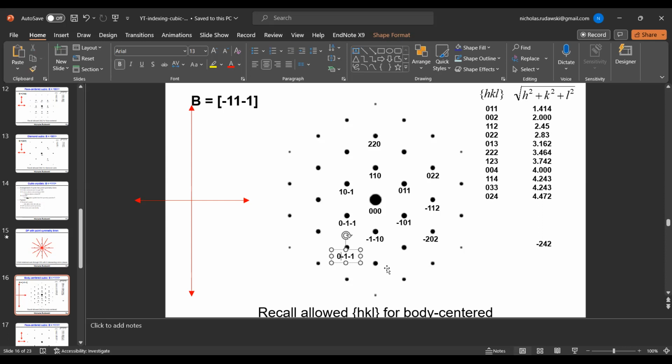So now this is not going to be in the same family. This should be in a 1 1 2 family, right? So this is going to be -1, sorry, -1, -2, -1. Yes, that is correct. Okay.